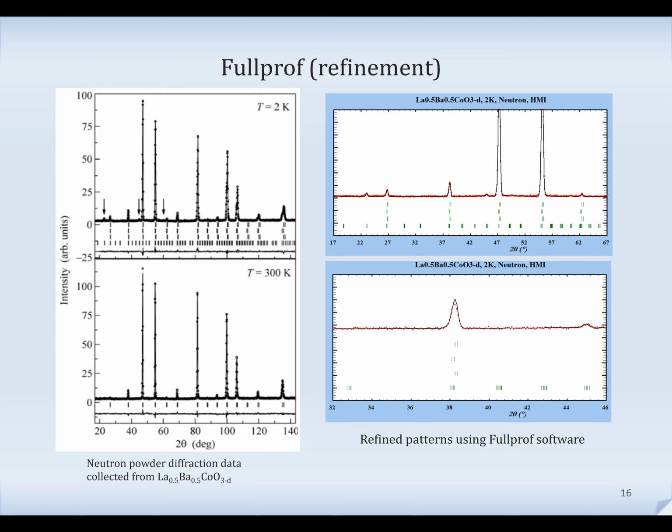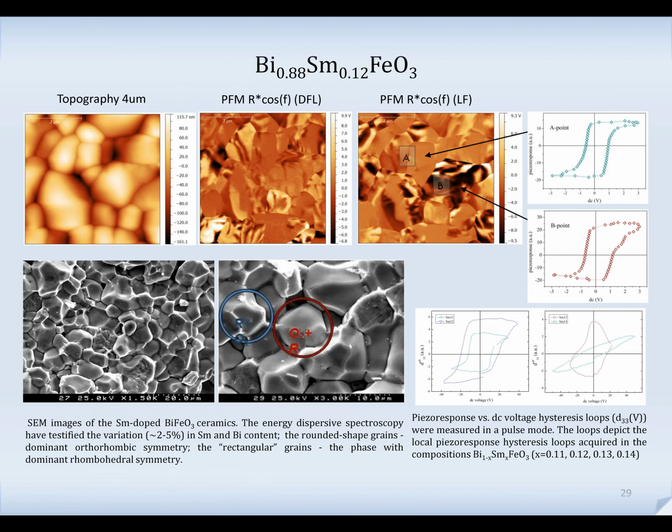Thank you, Vladimir. Okay, Igor, would you like to ask your second question? Okay, about PFM imaging, let me scroll. As I understand, practically always you have a piezo response or not. As I see, it's always present, but if not, in any case, it's possible to switch and find some non-zero response. Igor, you know better that it's everywhere.